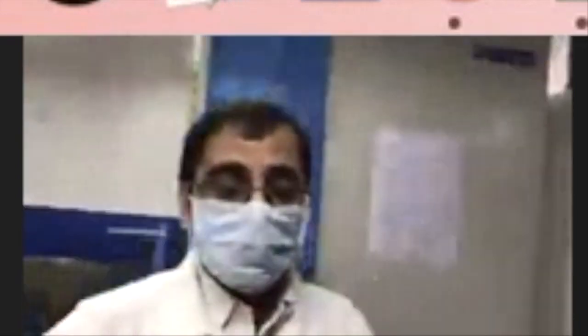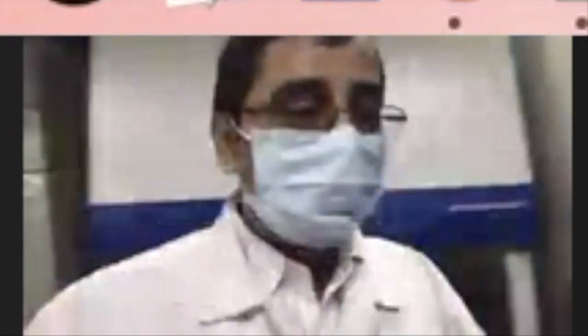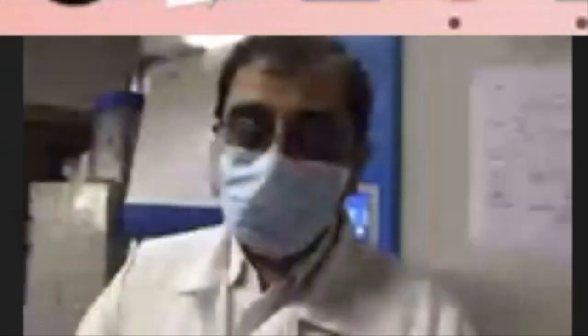I was trying to show you, if you can open one of the freezers, how these samples are stored. They're stored in really cold conditions of almost -80. Every box contains these clinical samples, or some of the genes of interest clones in glycerol stocks. These could be used for a variety of research, but their storage and their way of processing all require various workflows, SOPs, and quite a bit of optimization which we do in the lab.